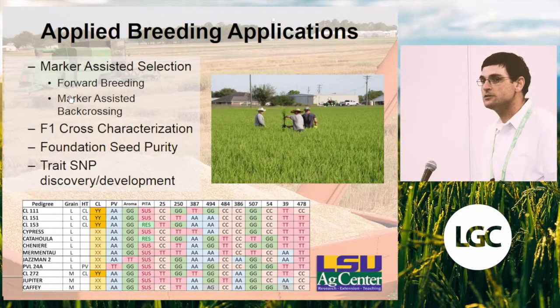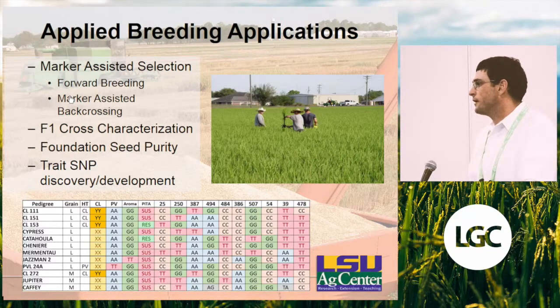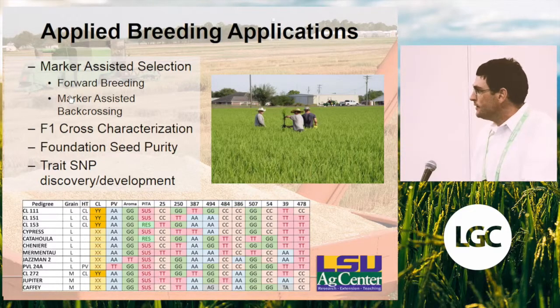The other big area that we do a lot of data points in is foundation seed purity. We produce and have a foundation seed program on our station. So all of the head rows that go out in that foundation seed, we'll do usually about 10,000 samples a year, just genotyping those to make sure that something didn't accidentally outcross or get mixed up, or a weedy rice get in there. So these are things that have really transformed what we can do. These are a picture of people going and pulling off types from a foundation field. The amount of off-types that we observe now just from genotyping these foundation seed lines has drastically gone down in just 1 year. You see the purity and the heterogeneity within our lines has gone down. So again, not the most scientifically exciting thing, but a lot of practical applications, and it really has a lot of impact on what we're trying to do.